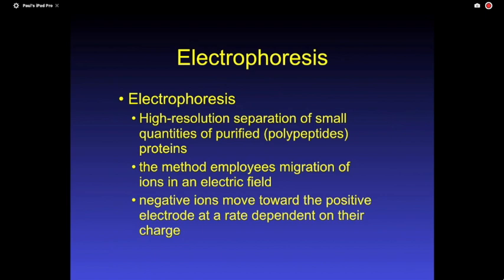In this case, what we're going to do is we're going to use either agarose or we're going to use acrylamide. Most proteins use acrylamide. How many people have actually interacted with an electrophoresis apparatus and done some separations? Okay, so the matrix, when you do, it kind of feels like jello, right? And so that jello is what's actually going to cause the separation.